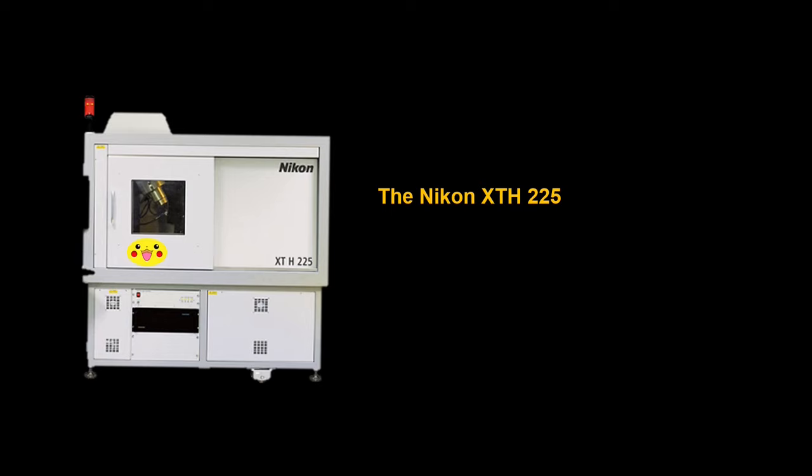This is the machine seen in all the What's In It Wednesday episodes. Now, the Nikon is a closed X-ray machine. The energy range of the Nikon goes from 30 kilovolts to 225 kilovolts. That's where it gets the 225. The energy range means it can scan a range of lighter or more dense objects. Almost anything that you can fit in the Nikon, you'd be able to image.